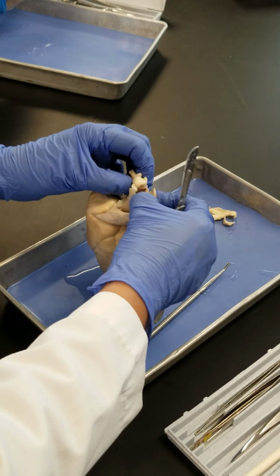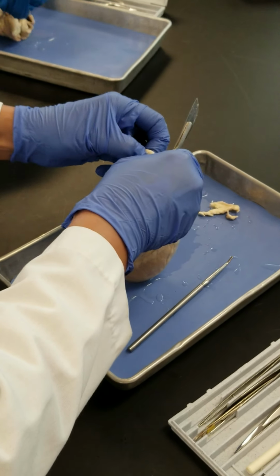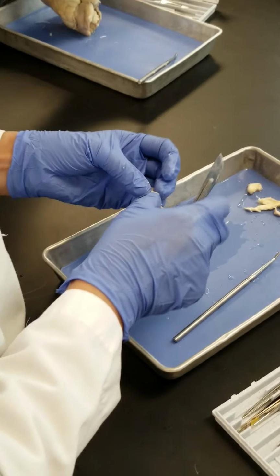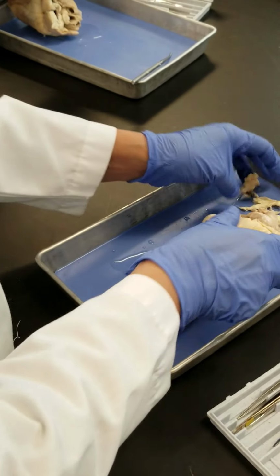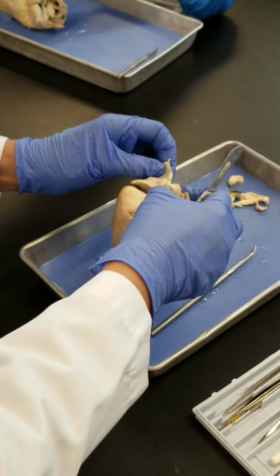Just clean them up better by taking these fats away. Oh man. A lot of that. Some in between.